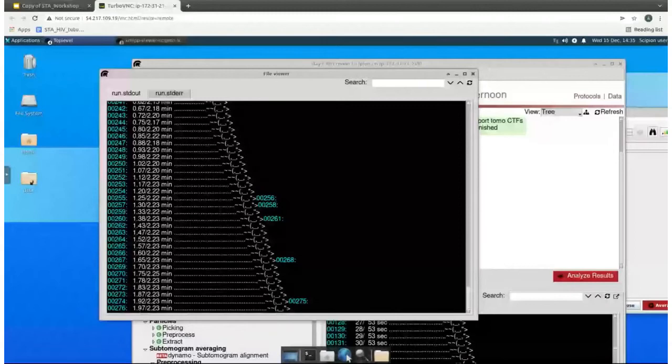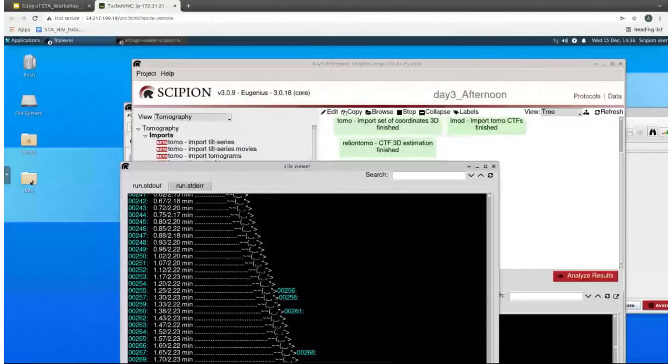Maybe during this waiting time, feel free to ask anything, even if it's not related to this practice. Maybe some more general question. Feel free to take this opportunity. I guess everyone has launched the classification, but otherwise you might want to put more threads, because I put very few, but you may put 12 as in the tutorial. Yes, you are right, Eveny. I put 3, but your machine has 16, you could put up to 12 if you have not launched it yet.